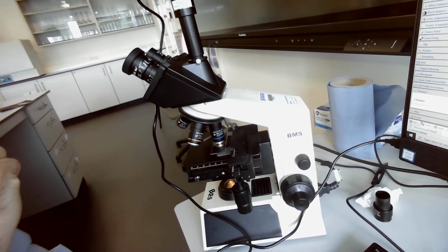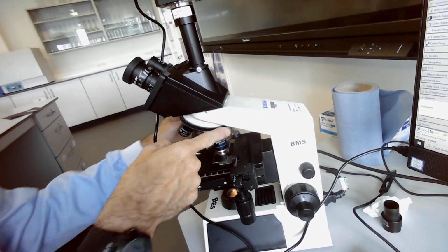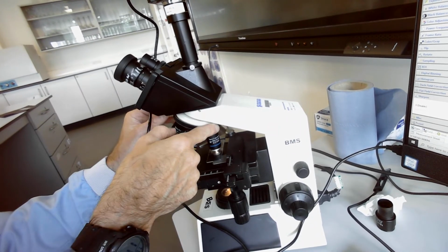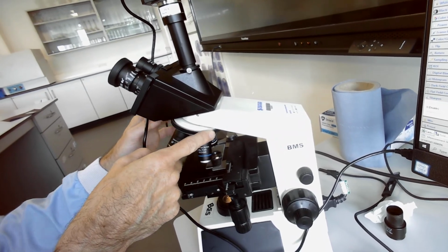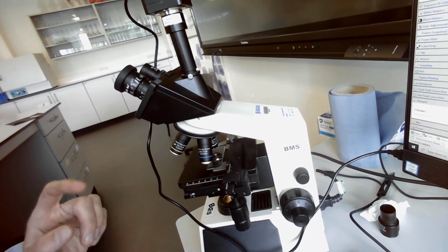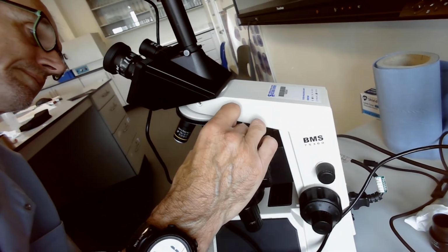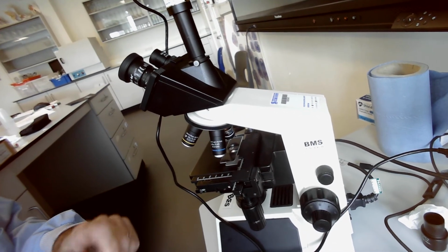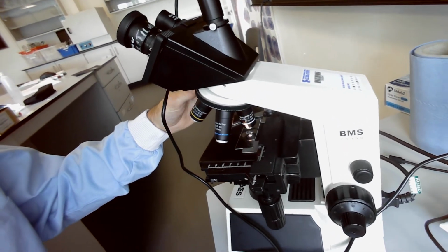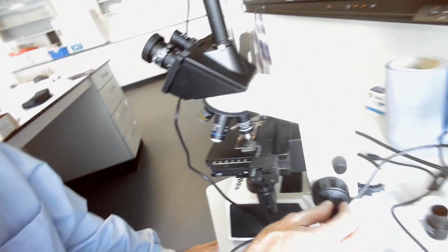But for bacteria and maybe red blood cells, because red blood cells are quite small, you really want to use the 100x objective. So again, I move the lenses to one side. I'm not dipping the oil immersion lens in yet. I now put a drop of oil where the light's coming up. And then I move the oil immersion lens into the oil. And then we focus carefully.